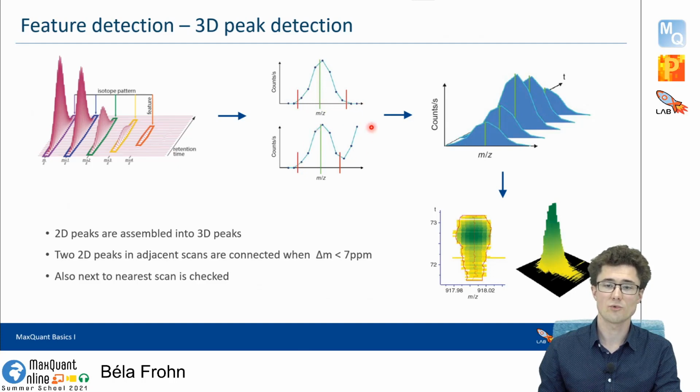Or if there are 2 neighboring peaks, the first point that goes up again is not counted as belonging to this side here anymore. So this data point here is lower than this one, but this one here is higher, so here is our cutoff value. So we say then this here is one peak, or this here is one peak, which is a relatively simple approach. And then we find the middle here, and this will then be our center of this peak, so this green line here. And this we assume is the mass to charge ratio for this one peak here.